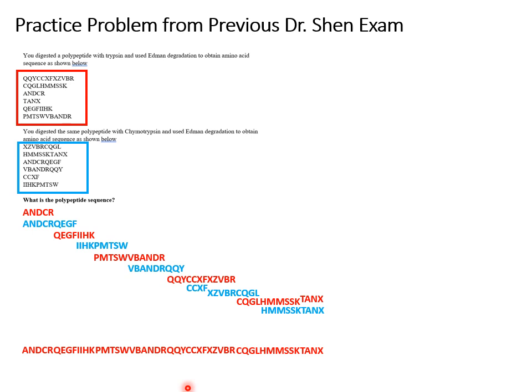Okay, and like I said, you could also use the chymotrypsin order. That's the same exact thing. The blue, even though the fragments are different lengths and different starting points, it's all the same sequence. So notice when we write that out, then we continue here, it's all the same sequence, okay?